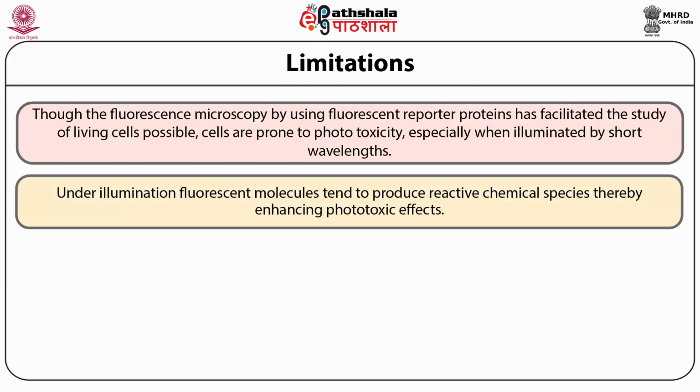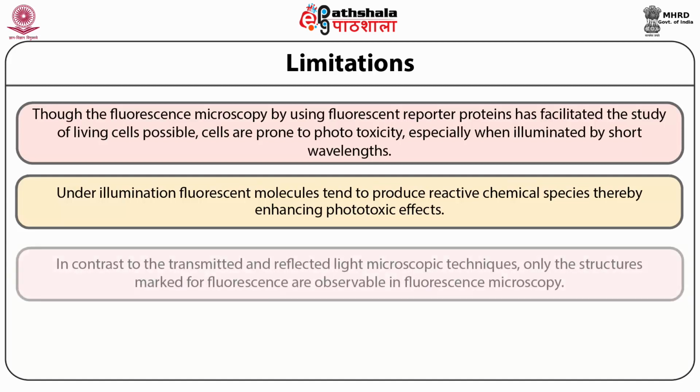Under illumination, fluorescent molecules tend to produce reactive chemical species, thereby enhancing the phototoxic effects. In contrast to transmitted and reflected light microscopic techniques, only the structures which are marked for fluorescence are observable in fluorescence microscopy.